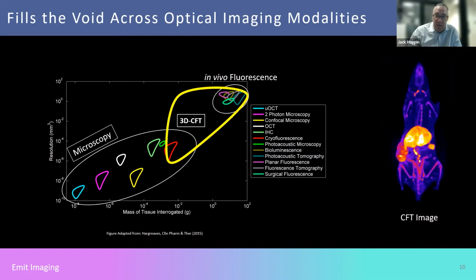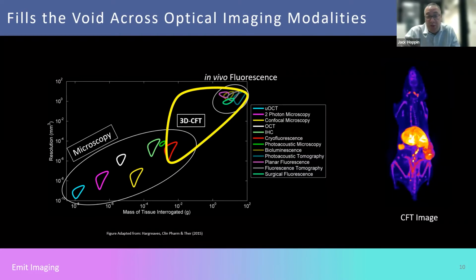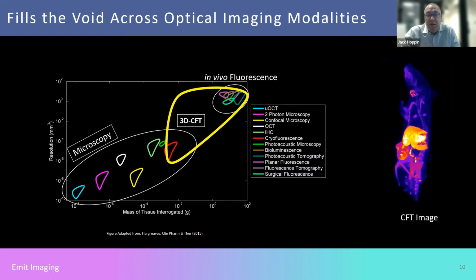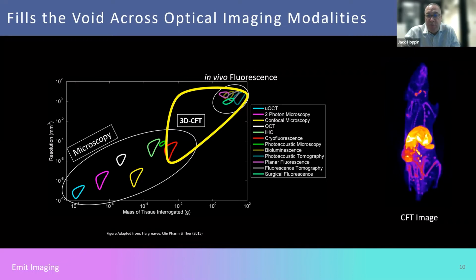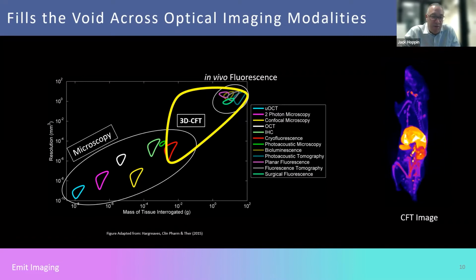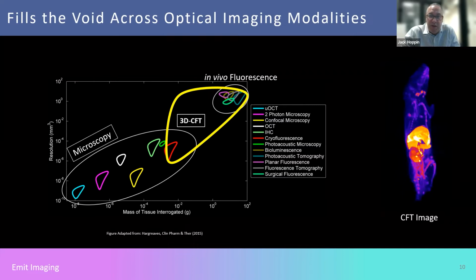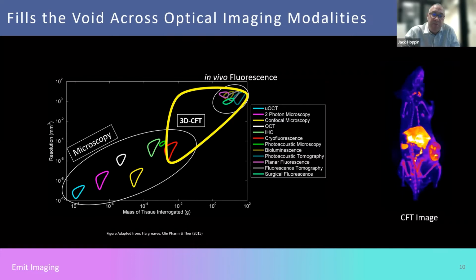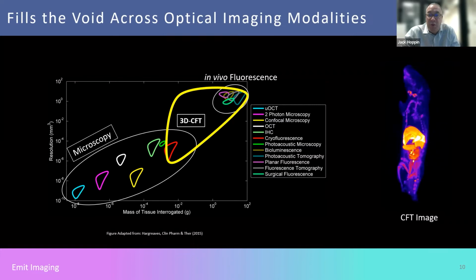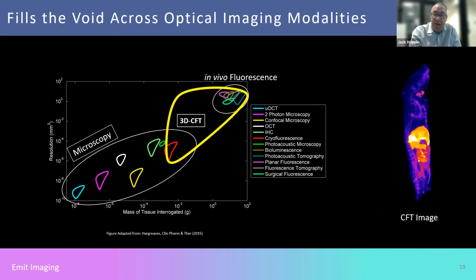And actually, I think we're getting more and more data out of the bright field images, but the RGB images also are very striking. We all love anatomical imaging combined with functional or molecular imaging in PET, SPECT, CT, but there's no better anatomical image than a 3D RGB image of the subject matter.